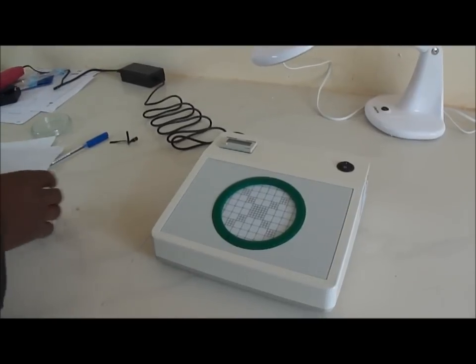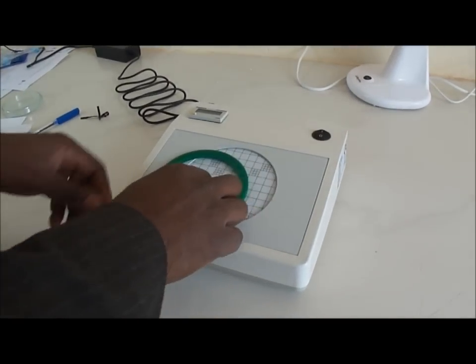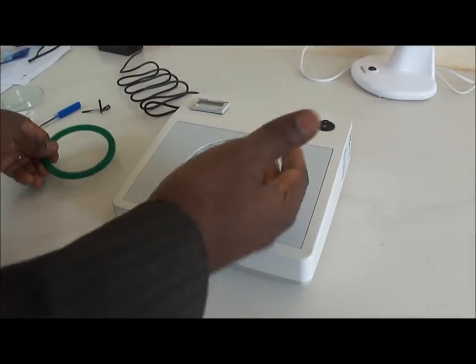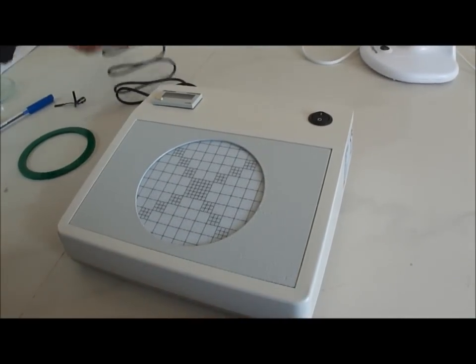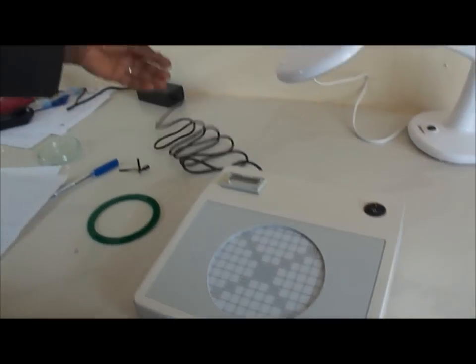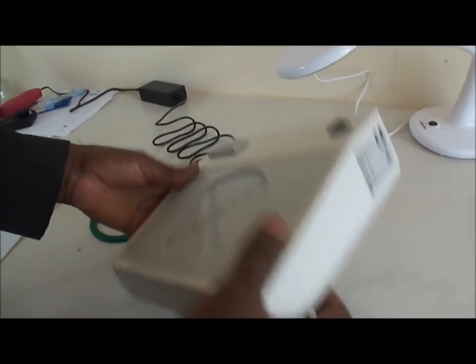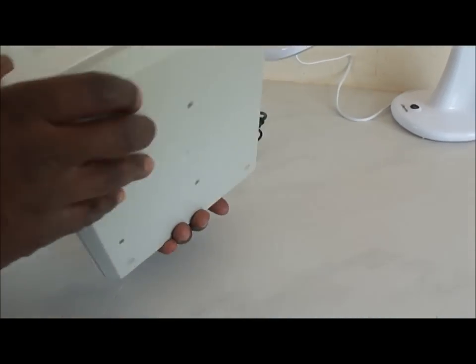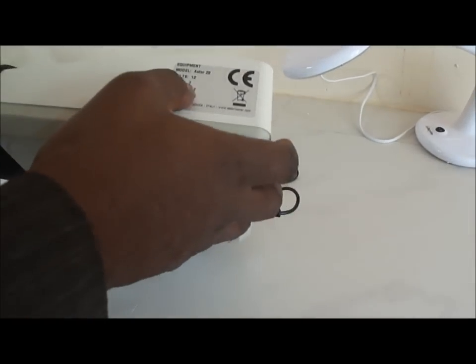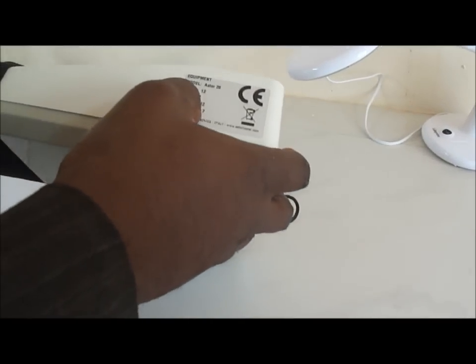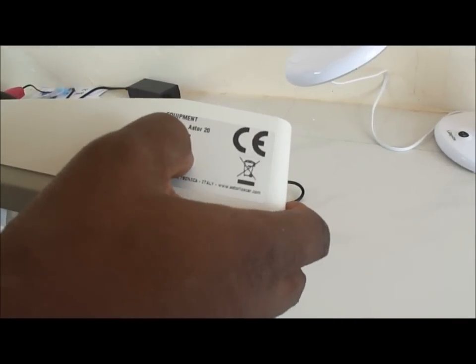When you receive the device it comes very simple, it has an electrical wire adapter, of course, and at the back here, you see the consumption is very low.